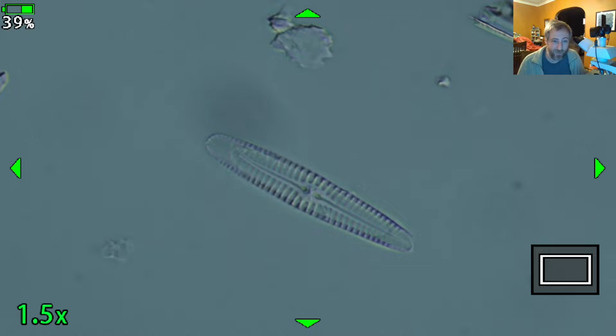So I have some examples from previous streams where we looked at marine incursions into freshwater systems, because the saline diatoms and the freshwater diatoms are very different from each other. So you can use them for reconstructing all kinds of things, but you can't look at one clone and another clone at the individual level and tell something about what's going on. Except people can use isotopic information from the skeletons of diatoms, just not like a tree ring or an ice core where there's a band. They'll just dissolve the whole thing and then look at the chemistry of it, typically the isotopes that the oxygen or the silica have in them.